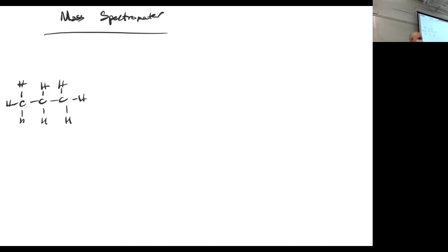All right, so that being said, here's our background to mass spec. That's a molecule. It's 3 carbons in a row. It's an alkane. What's its name? It's not methane. It's not ethane. Propane. Perfect. All right, so propane is your three carbon chunk. There's not much to propane. It's just this little guy.